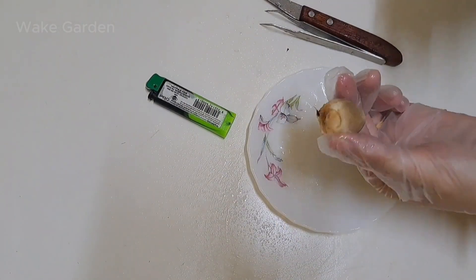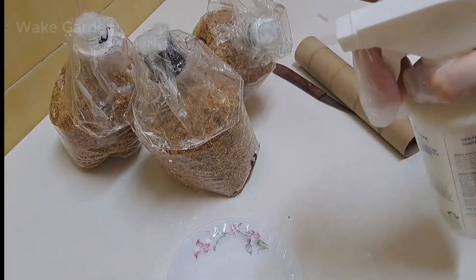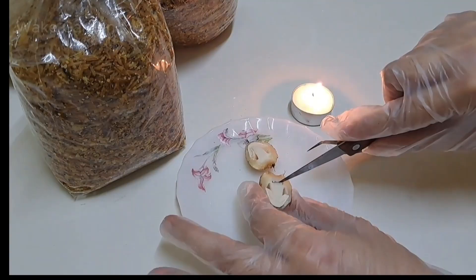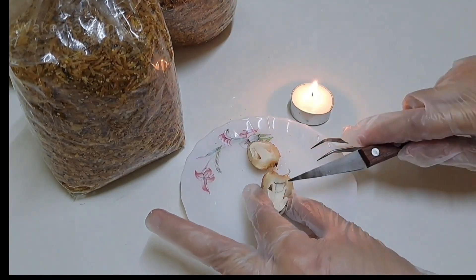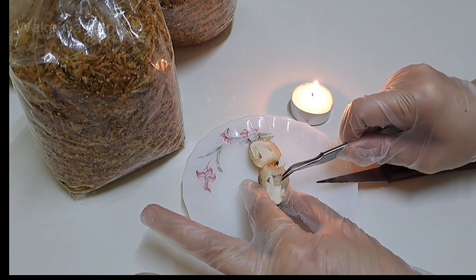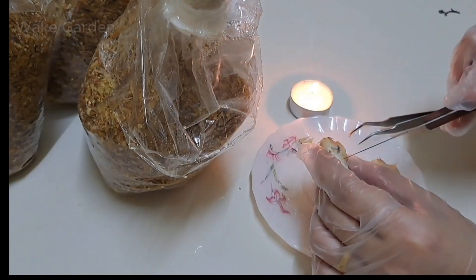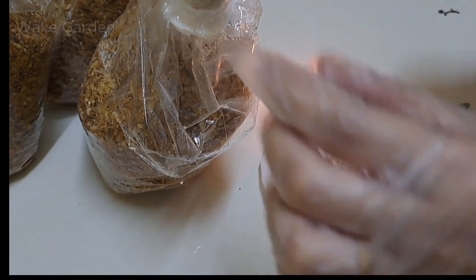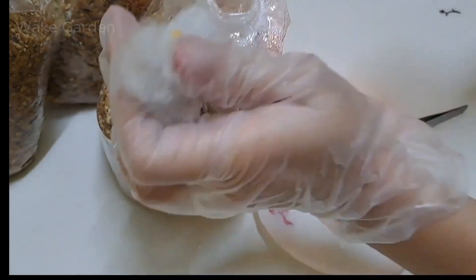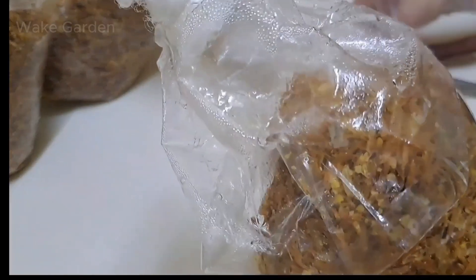Now let's move on to the sterilized grain-based method, which provides a cleaner and more controlled environment for mycelium growth. Take a sterilized knife or scalpel and cut a small piece from the mushroom's stem base, making sure to use only the freshest part with visible mycelium. Carefully open the sterilized bag of pasteurized rice husks and cornmeal, making sure not to introduce any contaminants. Using tweezers or clean hands, place the mushroom pieces evenly throughout the substrate, gently pressing them in to ensure good contact. Once done, seal the bag securely and shake it lightly to distribute the mushroom tissue evenly. Now it's ready for incubation.